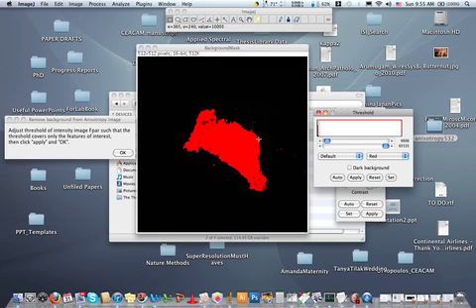Of course, the edges are always going to be an issue here, and you have to be aware of that. Also, just take note over here, my histogram is showing that I have the maximum value, 2 to the 16, 65,535. That means that some pixels are saturating at this moment. I don't want to include those.